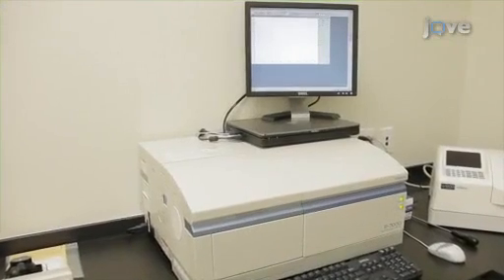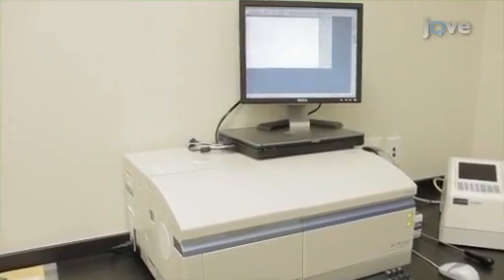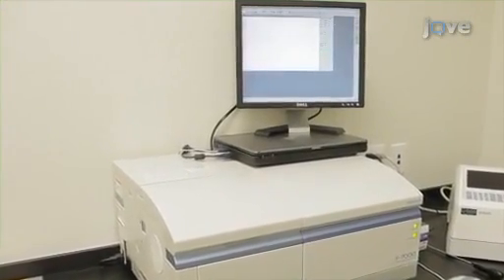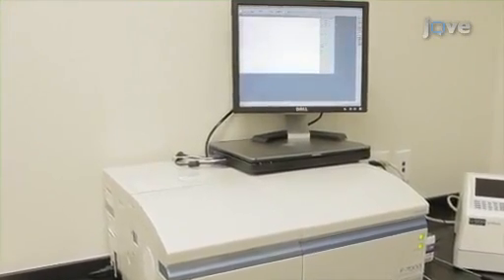This video features a Hitachi F7000 fluorescent spectrophotometer equipped with the quantum yield measuring accessory and report generator program. The F7000 is equipped with a high sensor.